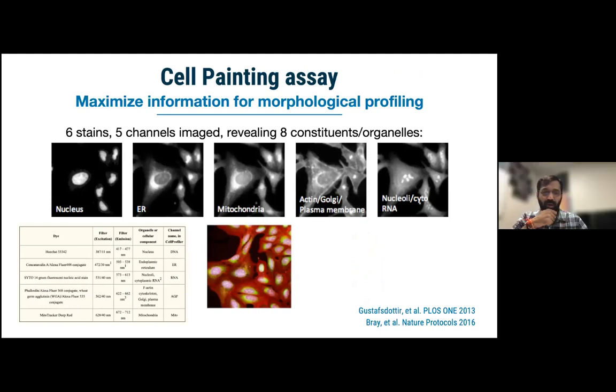I want to follow up on the texture measurement part. Typically, the intensities depend on the bit depth of the image. However, CellProfiler ends up scaling those intensities from 0 to 1. When you mentioned texture, you said there is a particular reference pixel, and you want to see how the intensity varies from that reference pixel to the pixels in other directions.